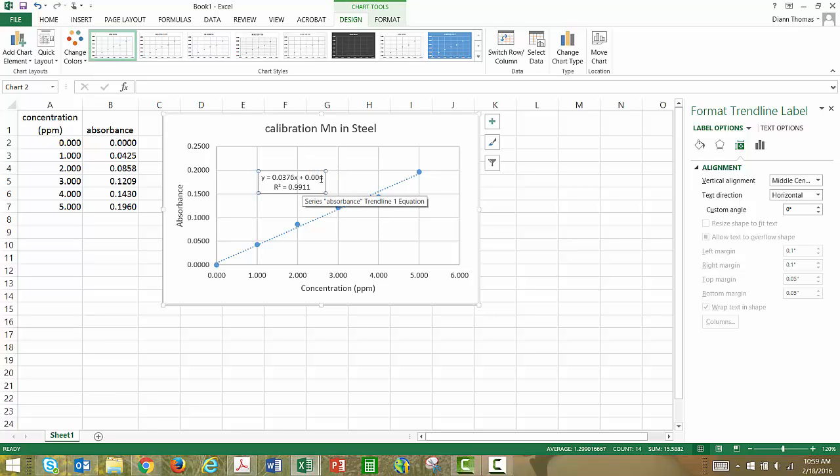So in reality, this 0.991 is actually not a very good fit. So we have to take this data with a grain of salt. But if we look at it, we've got a pretty obvious outlier here. Now, we could run it through a t-test. We could look at, how believable is that point? Is it truly an outlier? We did those calculations to look for outliers.